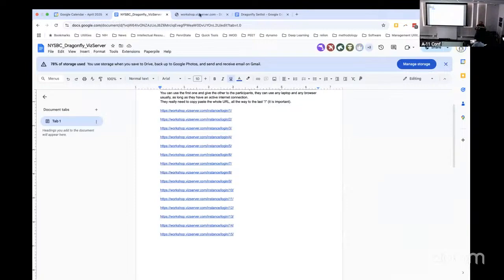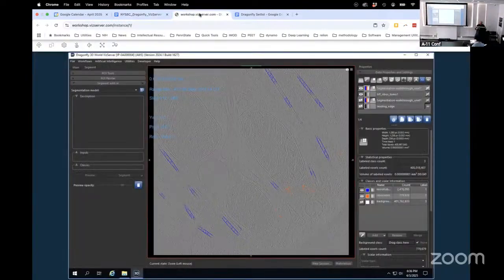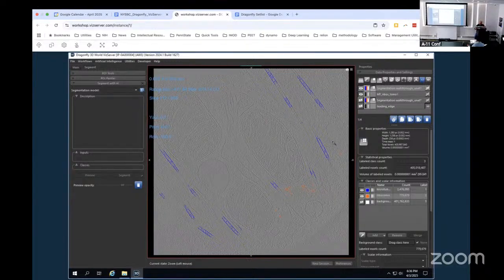Now, there is also a large threshold. Just so you know, if you go into remove islands, you can say remove large objects and give it a large threshold. But I don't find it nearly as useful. It has use cases.